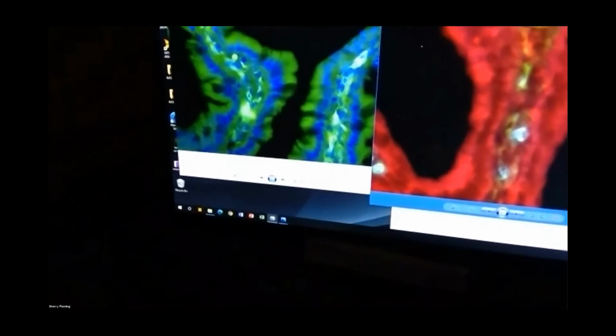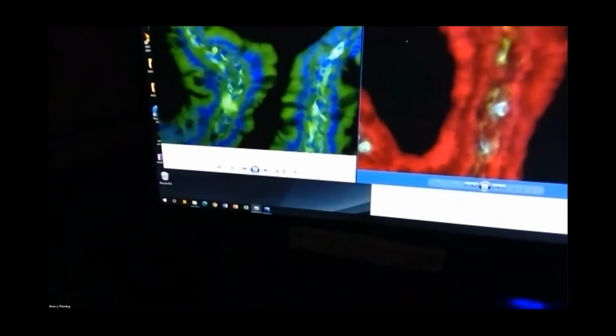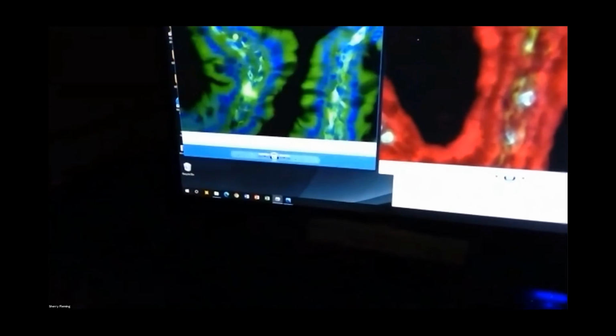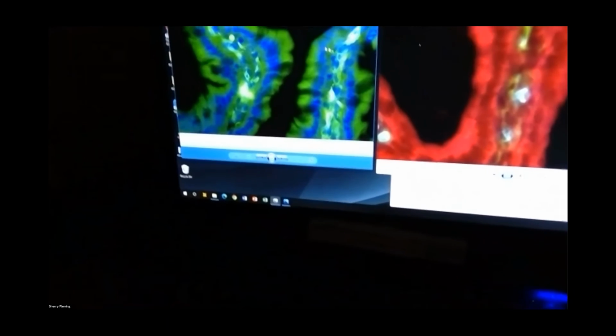We also work in an intestinal model, and here we have some of the villi from our intestine, and we've stained them here on the right with a marker to identify the epithelial cells, so that layer that surrounds the villi, but also the white blood cells that are in the blood vessels. And then on the left, we've stained them for white blood cells and for the nuclei of the villi, so that we could tell each individual cell. You can see that some of these white blood cells are starting to crawl out of the blood vessels and into the epithelial layer.